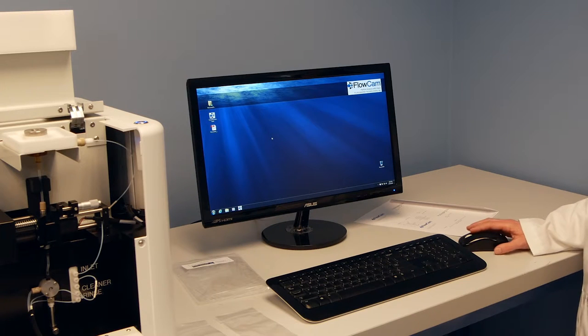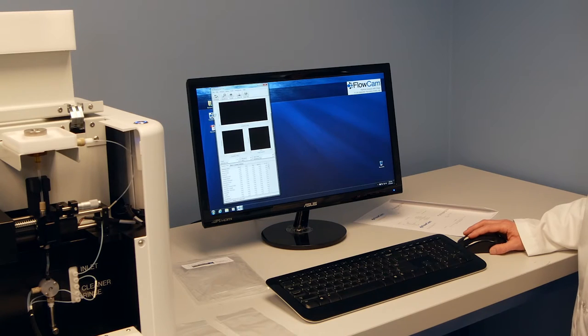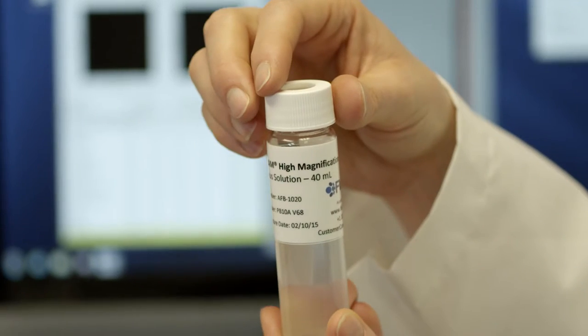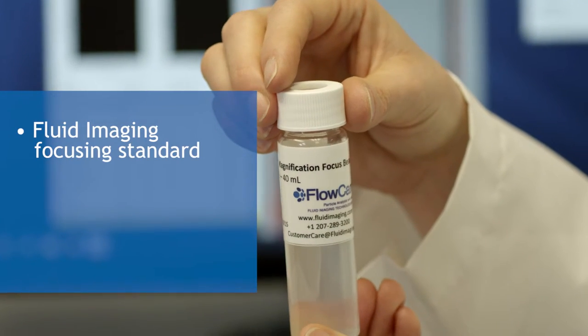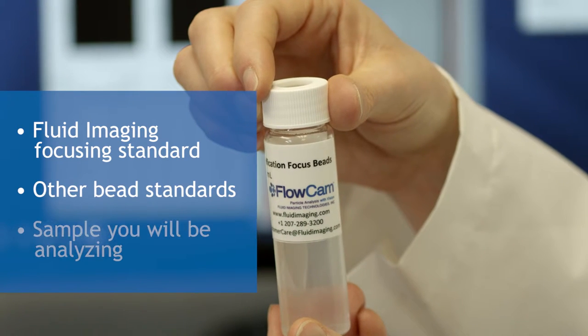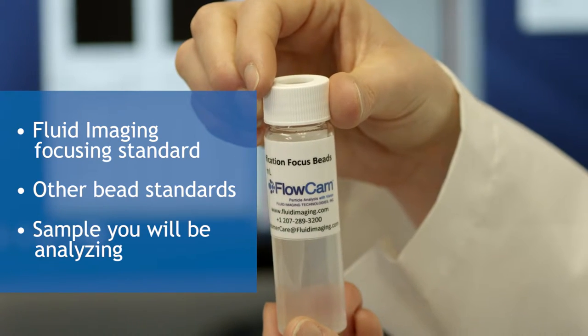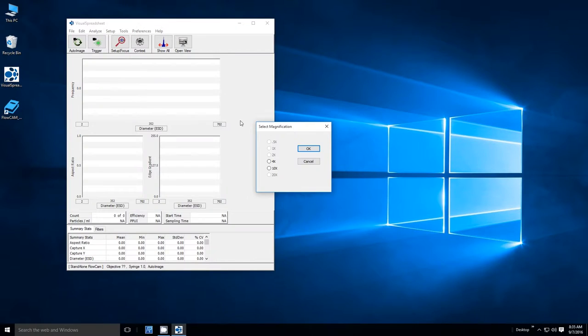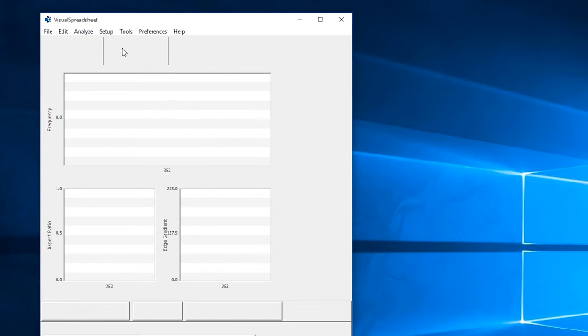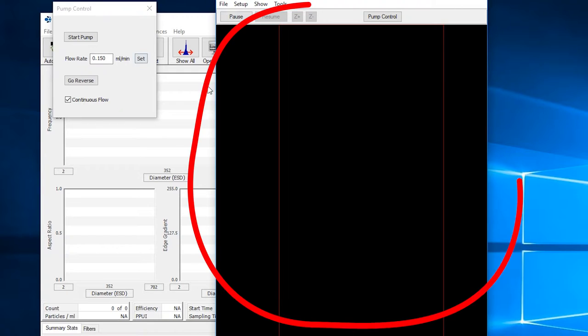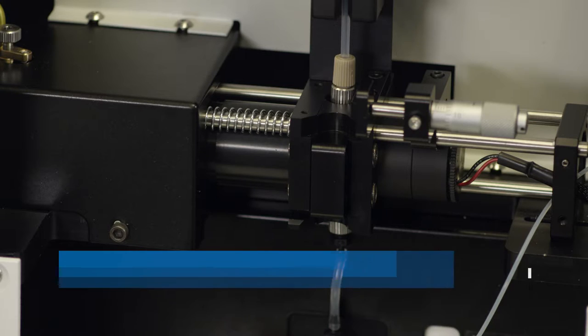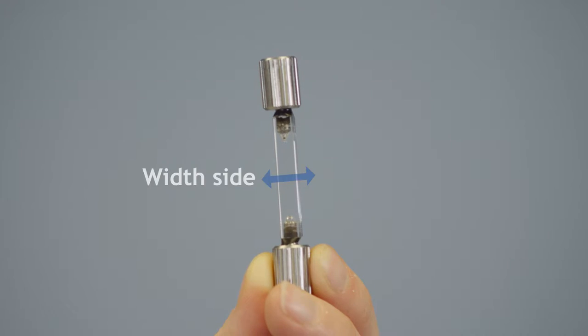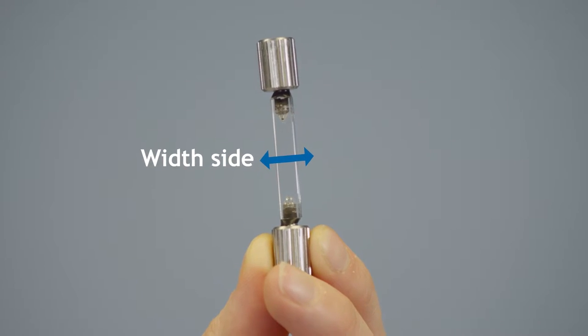Now you are ready to focus the flow cell in preparation for analyzing samples. To focus, you will need the Fluid Imaging focusing standard, other bead standards, or even the sample you will be analyzing. Begin by launching the Visual Spreadsheet software, then accessing the setup menu and selecting setup and focus. This will open a live view of the camera window. You will now be able to see parts of the flow cell. Make sure you have the flow cell installed correctly and are viewing the width of the flow channel and not the depth.